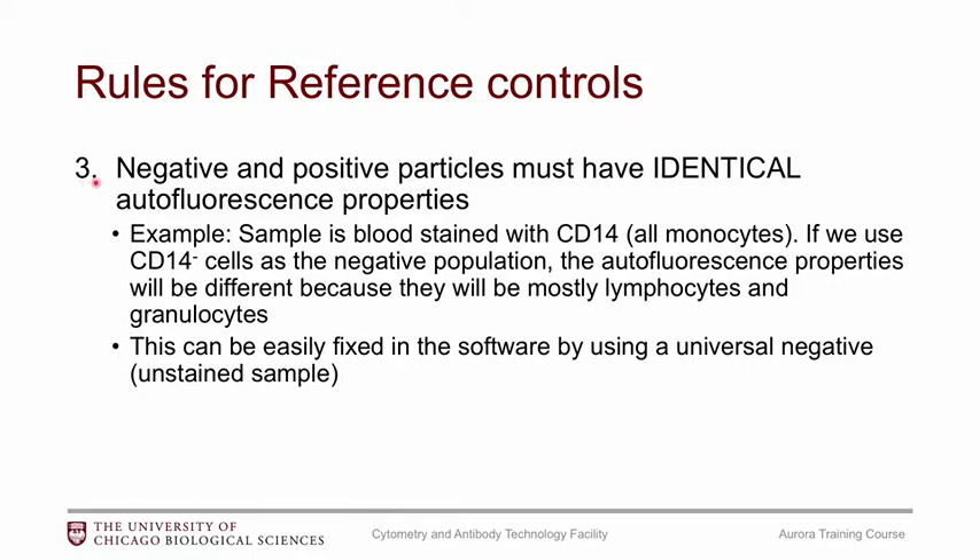Rule number three: your negative and positive particles must have identical autofluorescence properties. If your positive particles are compensation beads then your negative particles also have to be compensation beads — they can't be cells. A less obvious example: if you're staining blood with CD14, which stains monocytes, then the negative population would be mostly lymphocytes and granulocytes, and those cell types have different autofluorescence properties. You shouldn't worry too much because this can be remedied in software using a universal negative.